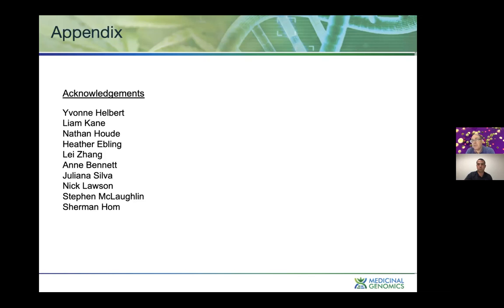The extraction process might enrich these things above and beyond the levels that they're in the flower, and that could have some negative consequences. But we're not scanning right now. I haven't seen any regulations out there that are looking for the penicillium-based mycotoxins. So I think that's kind of an unknown field at the moment.